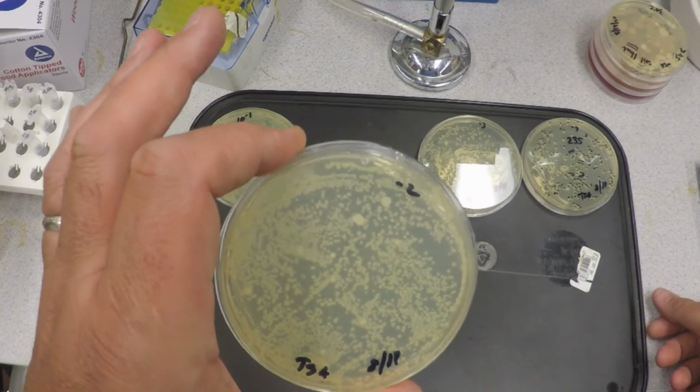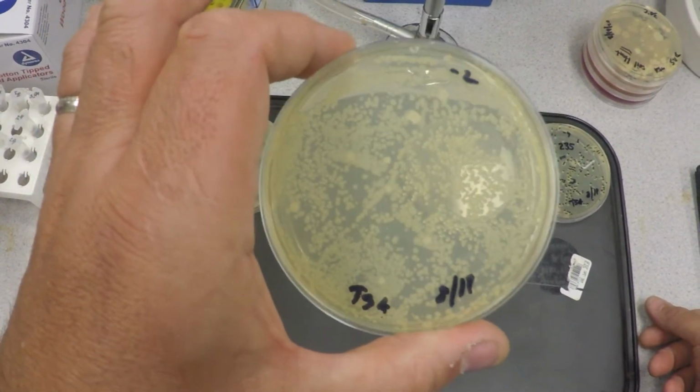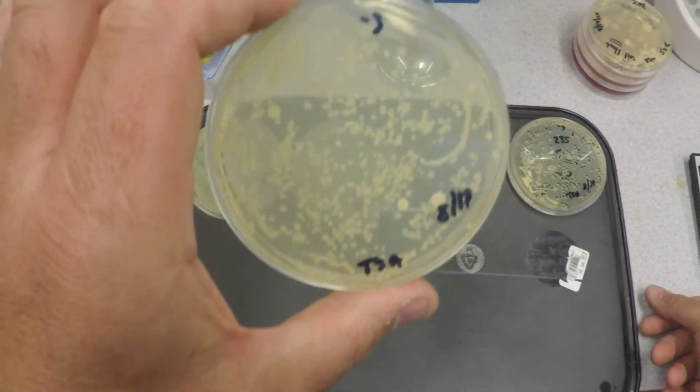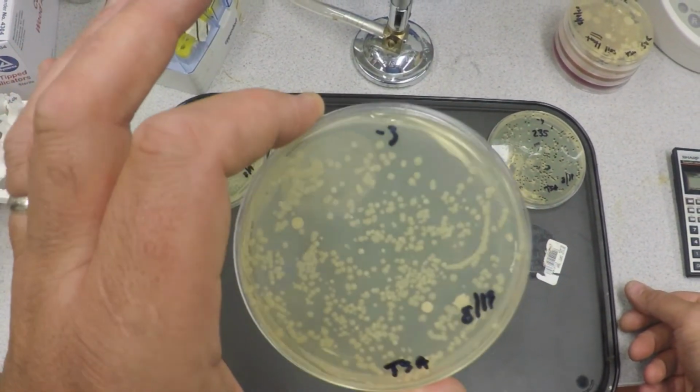Here's a 1 to 100, a little better, but still not countable by any means. 1 to 1,000, getting better, okay? I still wouldn't want to count these.